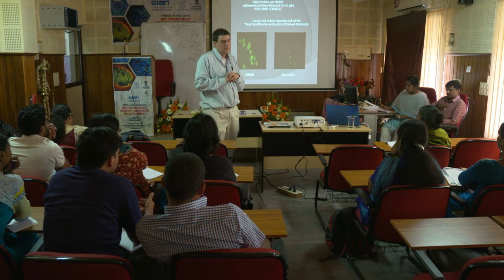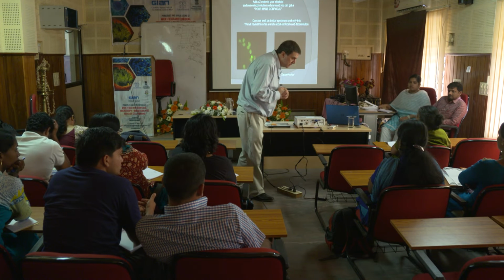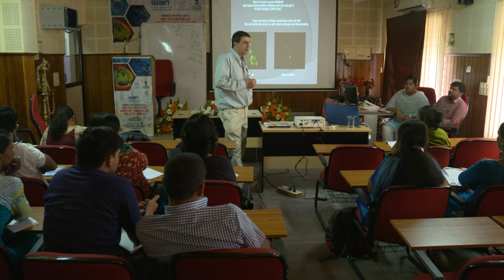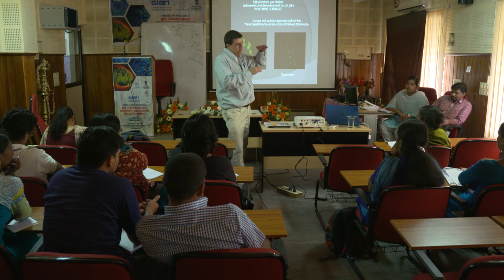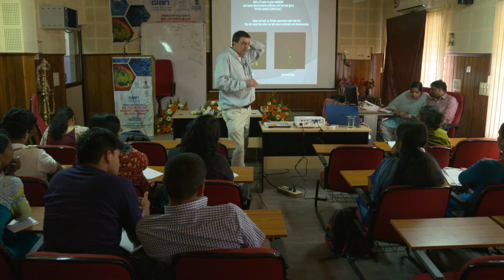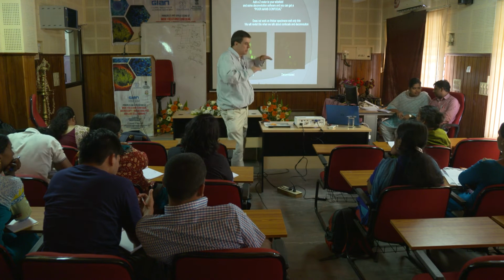But when we do live cell imaging, we cannot actually stop all the background, right? You're always going to have some. It's just inevitable. The trick, though, is to try to get the signal up as high as you can get it versus the background. And some of that's a little bit of playing around with the exposure.